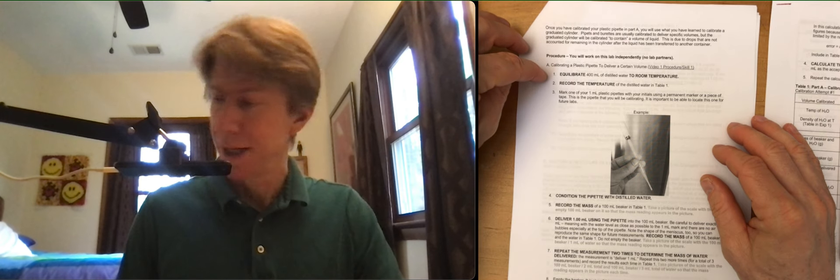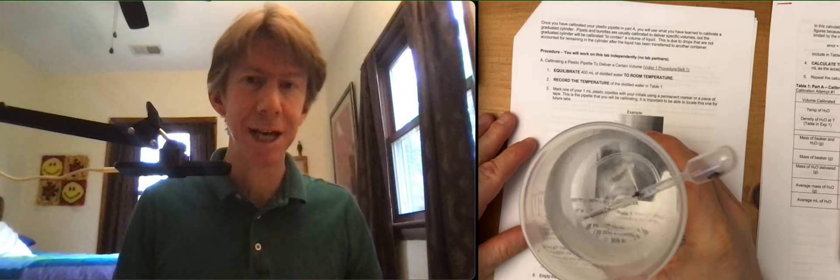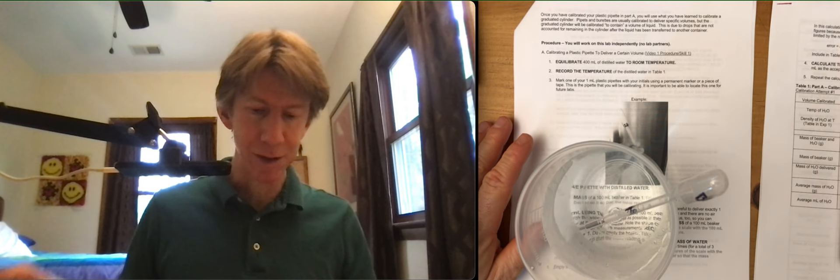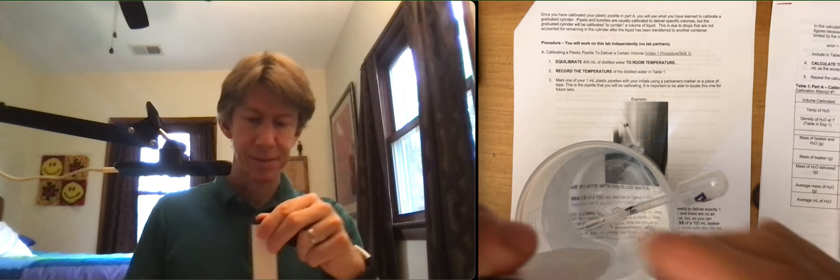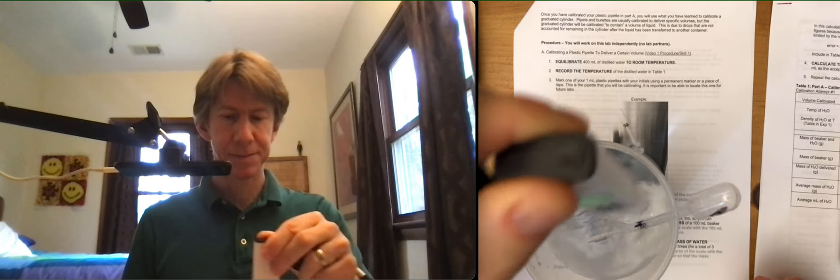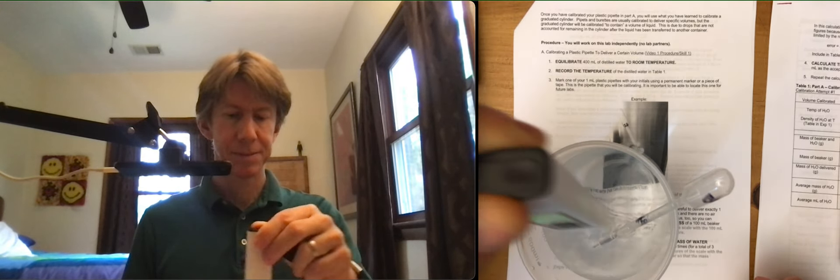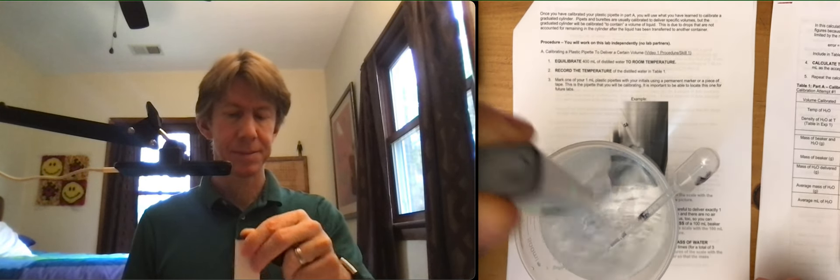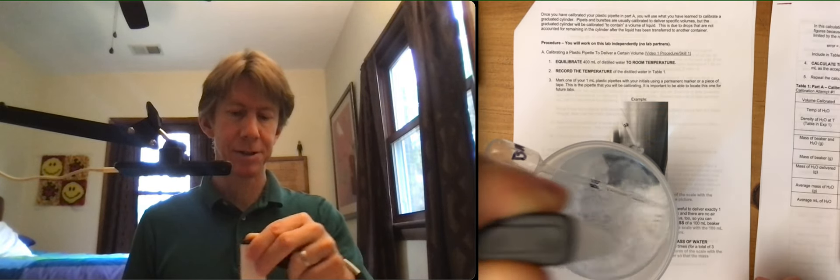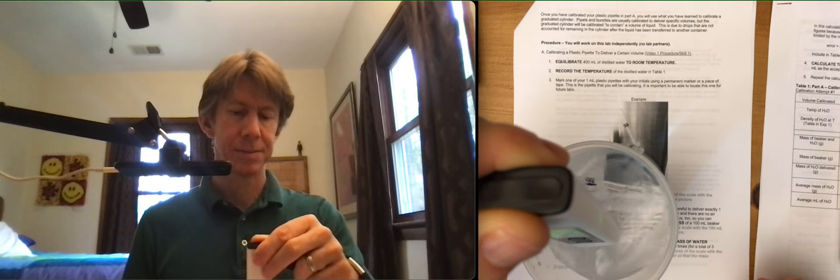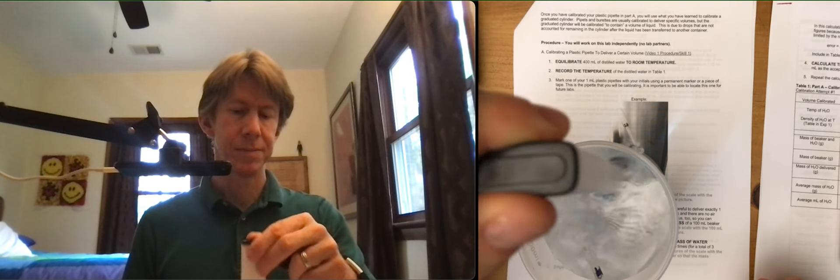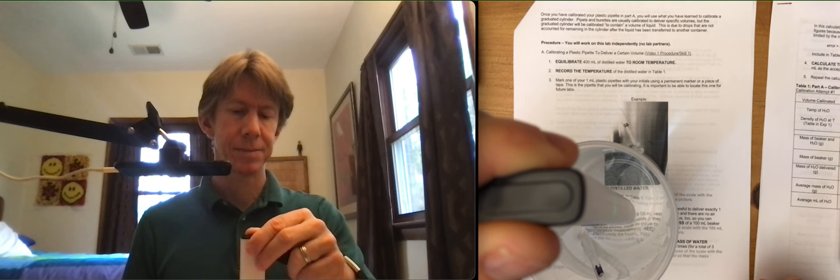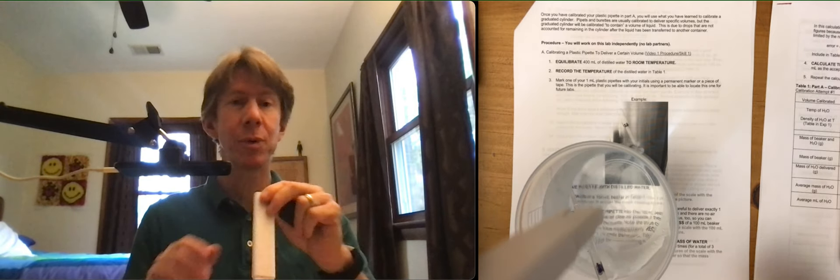So let's get to the procedure, calibrating a plastic pipette to deliver a certain volume. Equilibrate 400 milliliters of distilled water or tap water in this case to room temperature. Record the temperature of the distilled water, so it might have been in here for a long time. Get the temperature. Swirl it around.